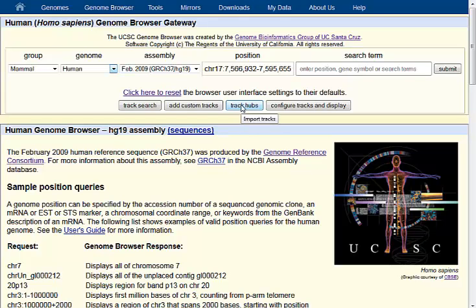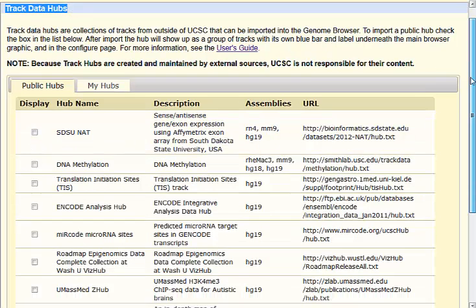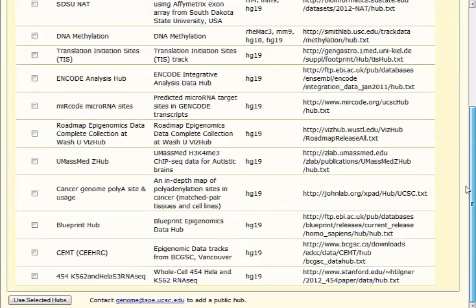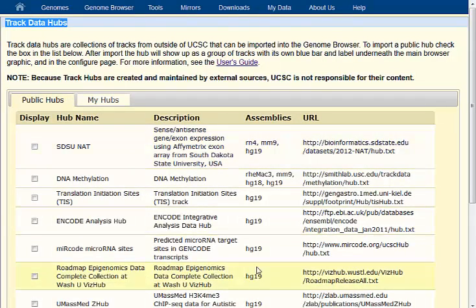If you click the button here for track hubs, you'll have access to the feature I wanted to highlight today. Here we have access to track data hubs — a number of research groups around the world that have provided a whole collection of data that you can load onto different genome assemblies.